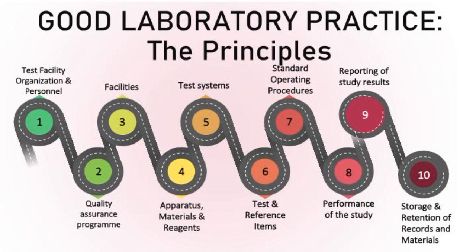Let's do a little revision here. As I had mentioned before, the GLP is composed of 10 main principles. The first principle, Test Facility Organization and Personnel, provides an outline regarding the management of the test facilities and the personnel involved. It discusses their job descriptions and the importance of training. The second principle, the Quality Assurance Program, describes the system that manages and ensures compliance towards the GLP. It describes the responsibilities of the Quality Assurance Personnel and all the documentations under his or her governance.